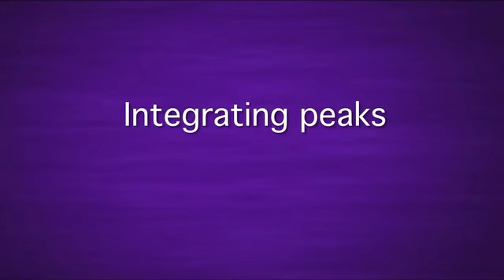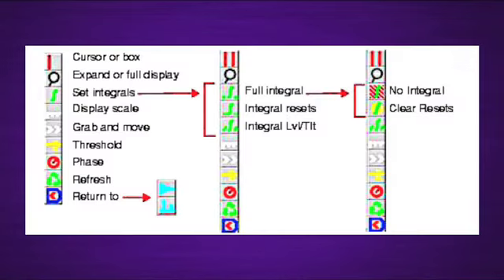Integrating peaks. Clicking on the integration icon moves it into partial integration mode. The integral resets icon is shown. Clicking on full integration shows the clear resets icon.